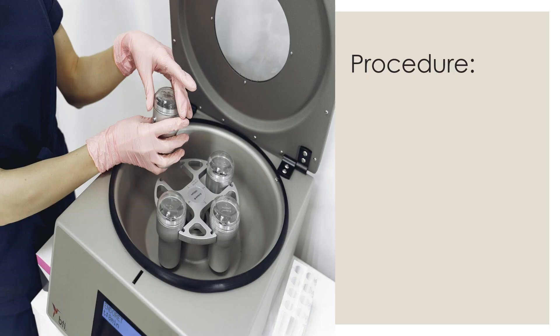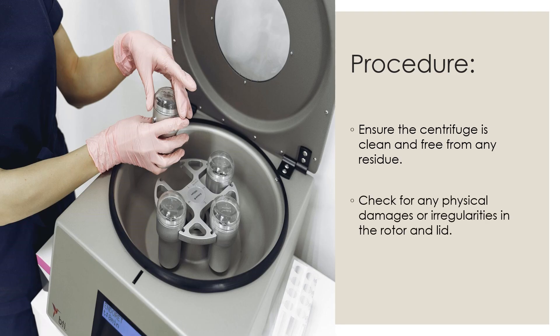Now we will discuss the procedure to calibrate the centrifuge machine. Before starting the calibration, we should ensure that the centrifuge is clean and free from any residue. Also check for any physical damages or irregularities in the rotor and lid, and overall check for proper condition, establishment, and its connectivity.